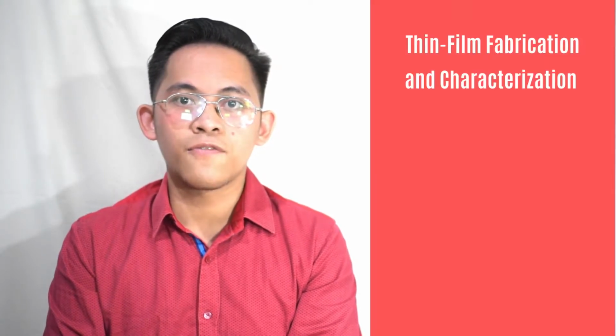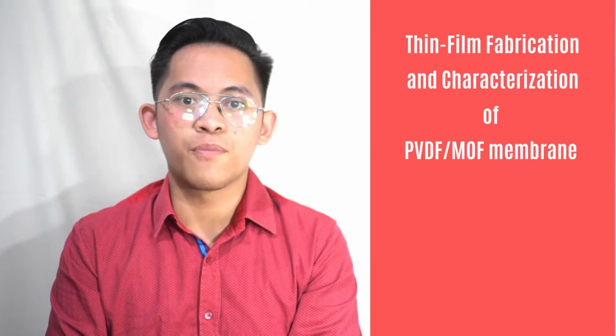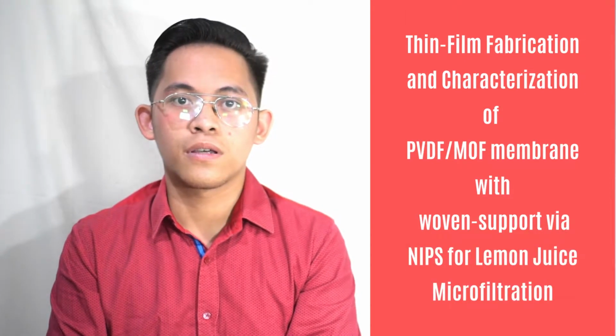As material science and engineering students, we dedicated our research to fabricating polymer membranes, entitled Thin Film Fabrication and Characterization of PVDF MOF Membrane with Woven Support via NIPS for Lemon Juice Microfiltration. I, Mikhail M. Brillantes, together with Narc Mikhail A. Gañac and our advisor, Dr. Alvin R. Caparanga.